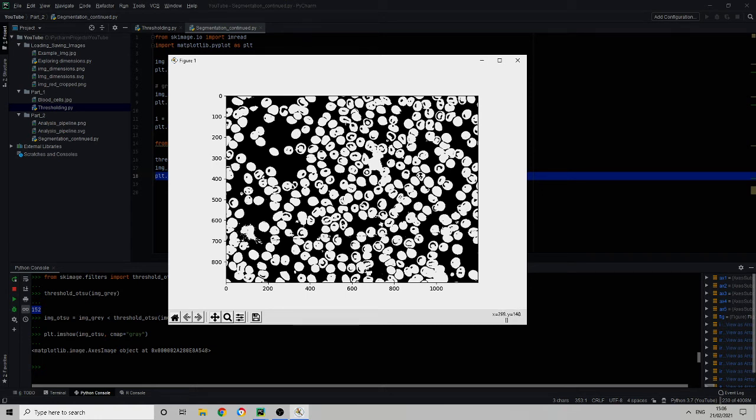But then there's also other instances where we have this kind of horseshoe shape. So what's happened here is that, because of the way it was thresholded with the Otsu, the perimeter wasn't connected, unfortunately. We're going to try and deal with that by doing an image closing. I'm going to close the image. And yeah, we have a lot of the donut shapes mainly. Oh, here's another horseshoe.